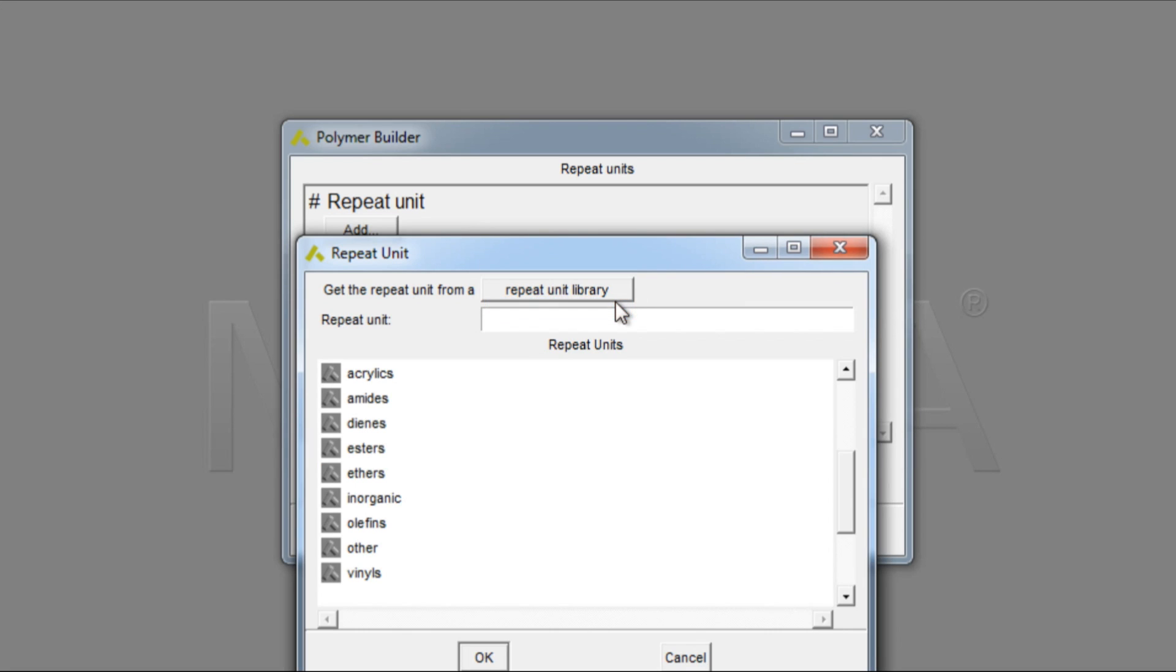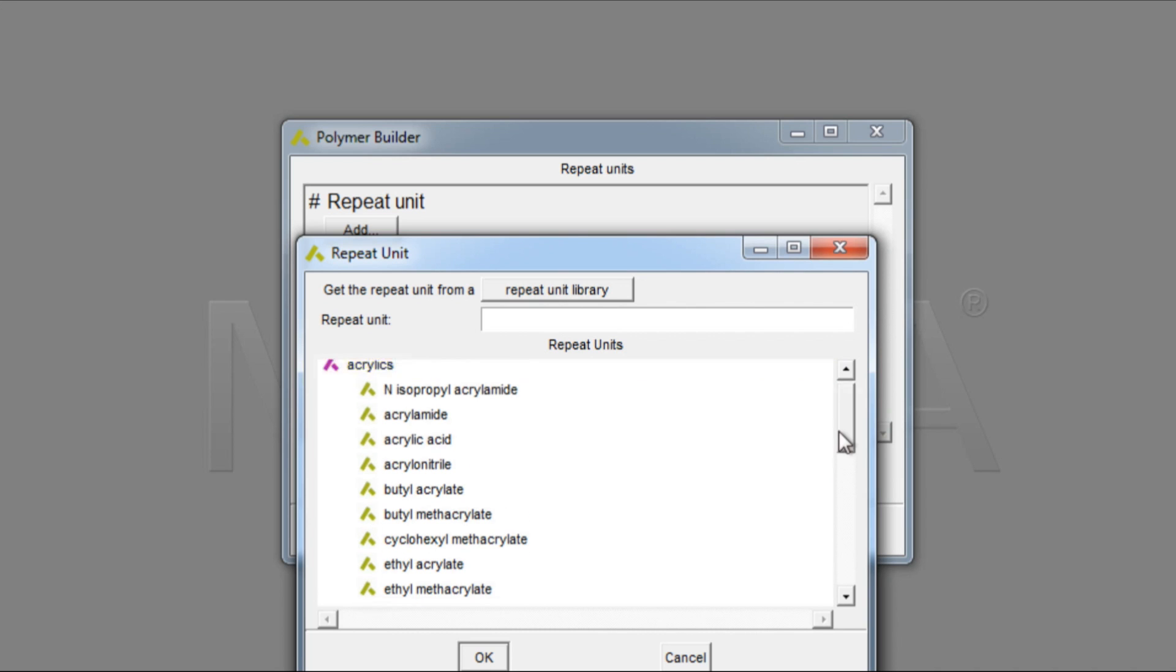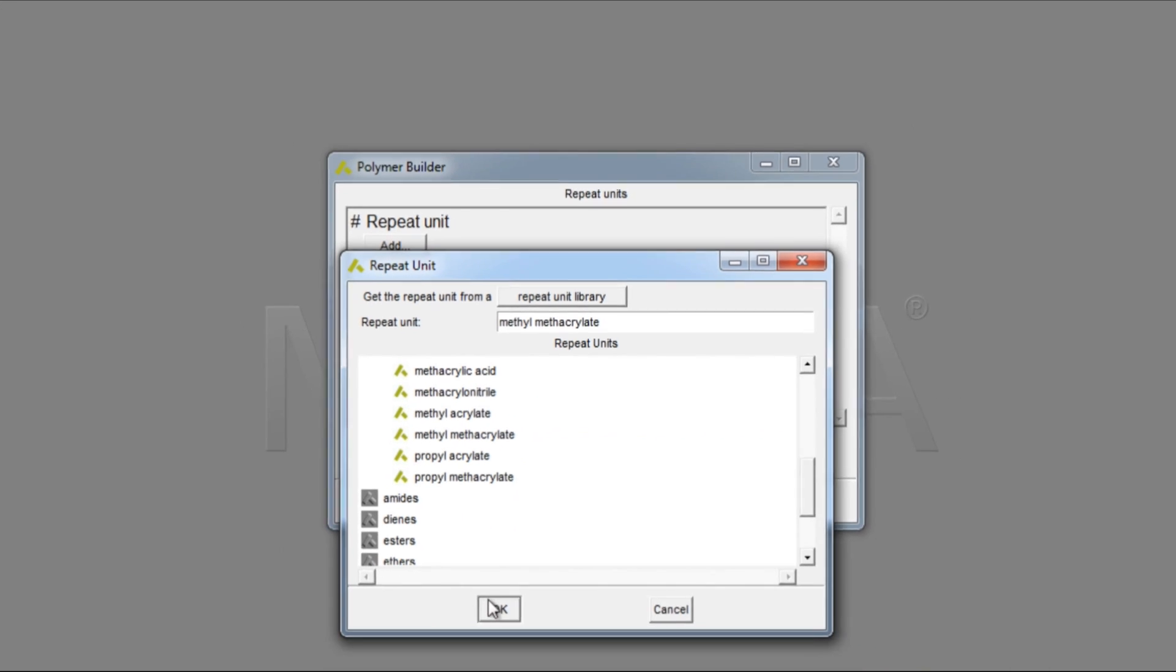We'll choose Methyl Methacrylate Monomer from the library as an example. Under the Acrylics, choose Methyl Methacrylate, click OK.